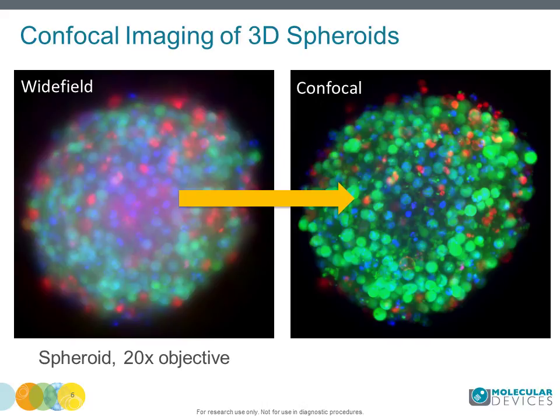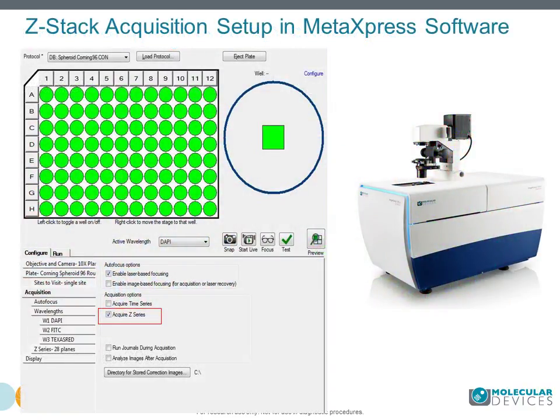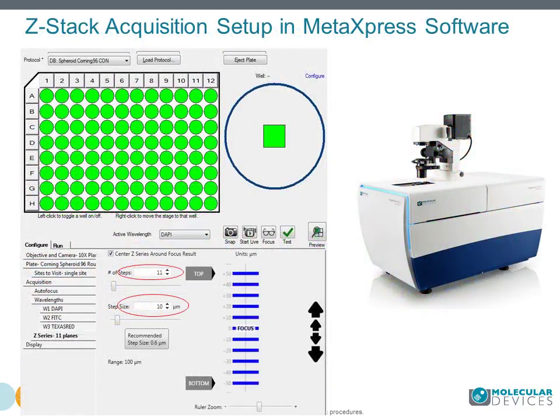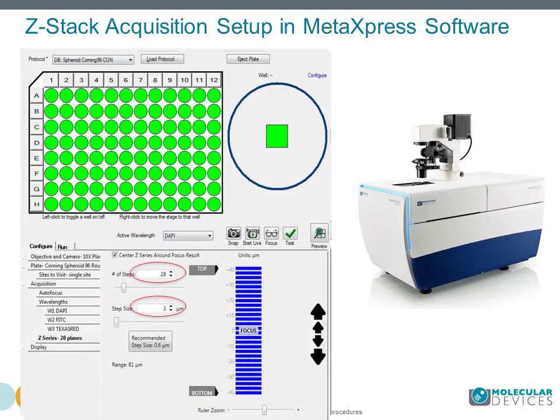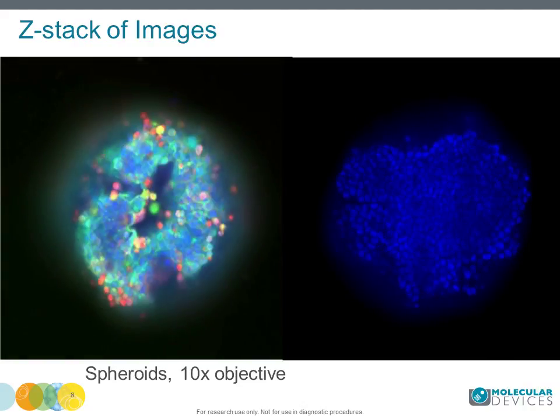Another challenge in performing a spheroid assay is the ability to image and analyze 3D objects. Common issues include difficulty of light penetration into the spheroid, scattering of light by cells, and background from out-of-plane fluorescence, which makes images blurry. Confocal microscopy provides efficient background rejection and gives sharper images. Images should be taken using automated confocal mode with a large field-of-view camera. MetaXpress software allows modification of the number of z-planes and distance between planes.